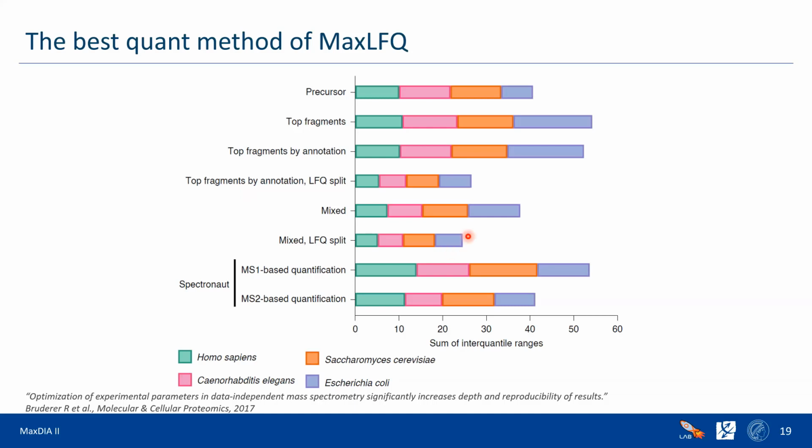And you see results actually getting worse compared to the previous, but why? Probably LFQ split is really advantageous. And as we see, it is. So now we come to the thing which we discussed. We're keeping precursor intensities, we're keeping each fragment separately and treating them as separate instances, which helps us find better normalization. And this actually works really well.